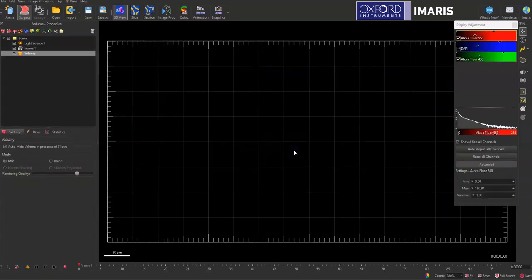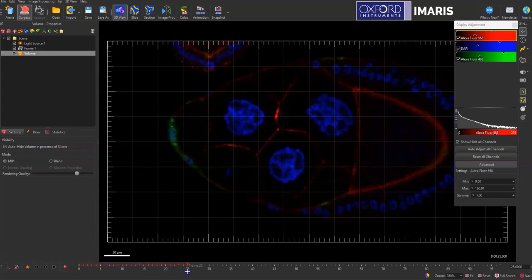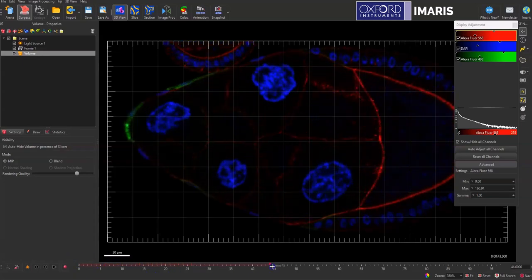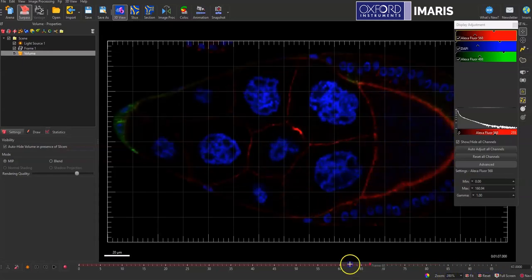This will swap the Z dimension into a time series and as you can see here as I slide through the different time points it's actually sliding through the different Z planes.